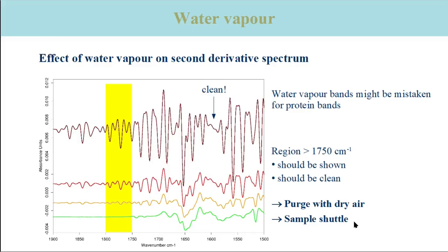There is a small region around 1600 reciprocal centimeters which is free of water vapor bands. Note also that there are no bands in the protein spectrum above 1750 reciprocal centimeters. These two characteristics can be used to identify water vapor bands in infrared spectra of proteins. Sharp bands everywhere except around 1600 reciprocal centimeters indicate water vapor bands. In contrast, the absence of sharp bands above 1750 reciprocal centimeters demonstrates little impact of water vapor on the spectrum.